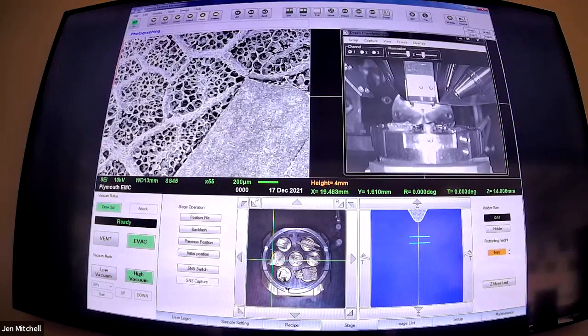Let's take a photo of that because I've actually got the focus pretty good today. We'll zoom in and have a look at this a little bit closer and look at the bottom of the leaf as well. It's very spongy - spongy mesophyll, that makes a lot of sense. These bits are all the chlorophyll and everything, live.